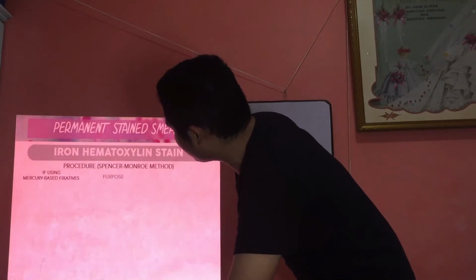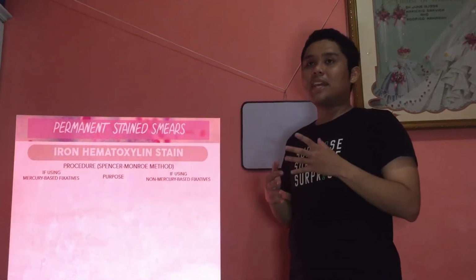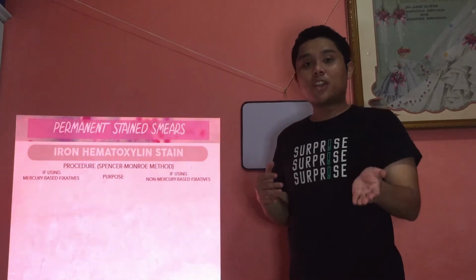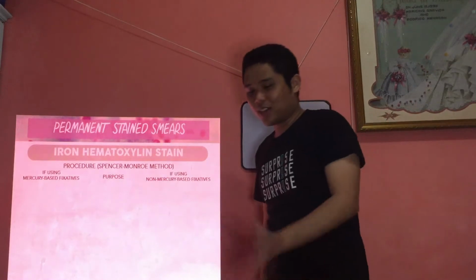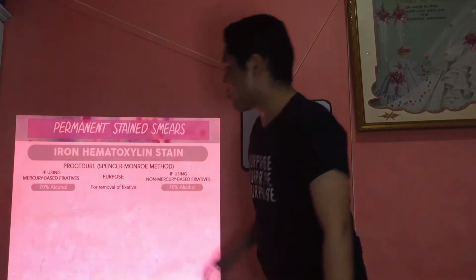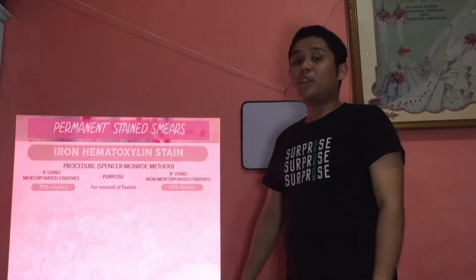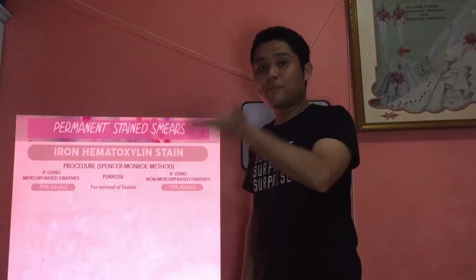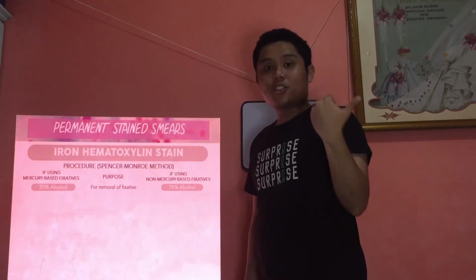For the Spencer-Monroe procedure, we have two methods because it depends on whether the fixative that we use has mercury, for example PVA, or is non-mercury. We start with the reagent 70% alcohol. Both of them start with 70% alcohol. What's the purpose? For removal of fixative, the same purpose as the one in Wheatley's trichrome.